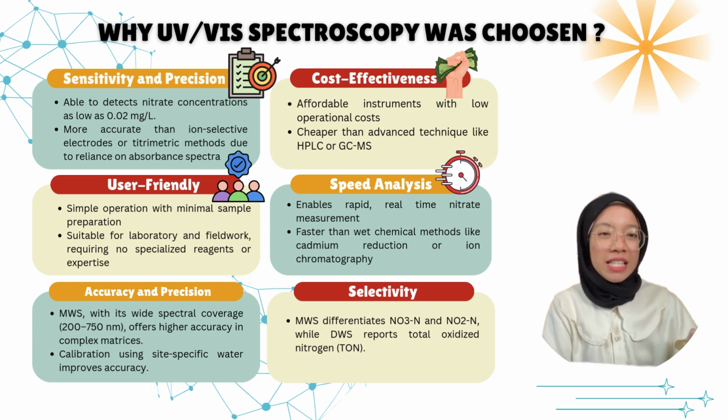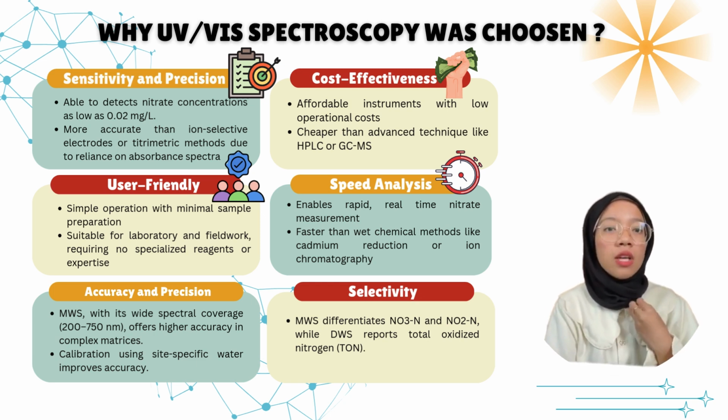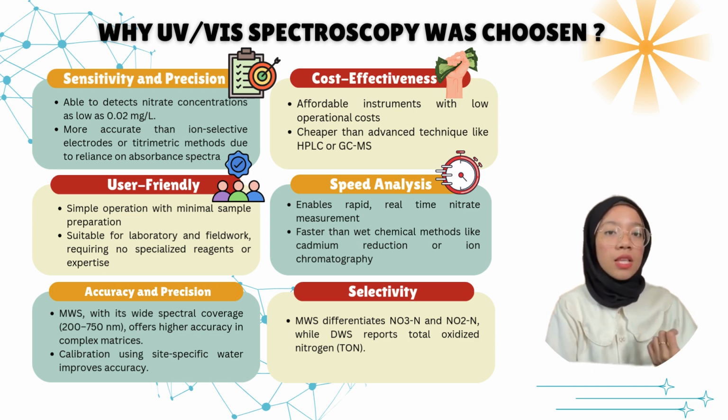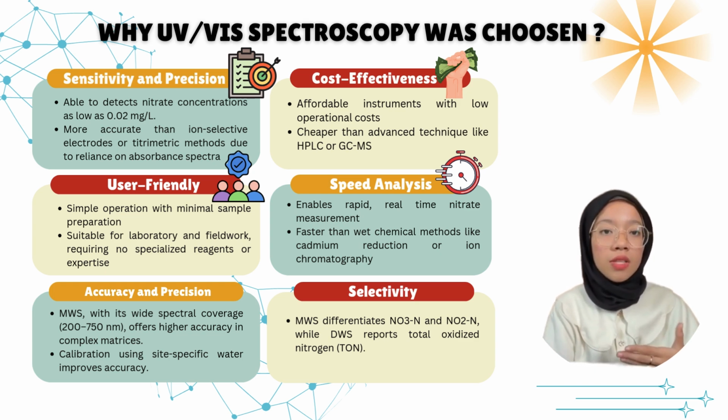Next, this technique is cost-effective. The instruments are affordable and operational costs are considered low. Compared to more advanced analytical techniques like HPLC or GC-MS, UV visible spectroscopy provides significant cost savings while still delivering reliable results.